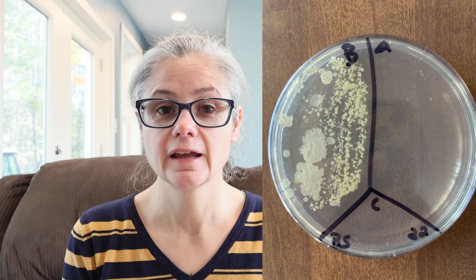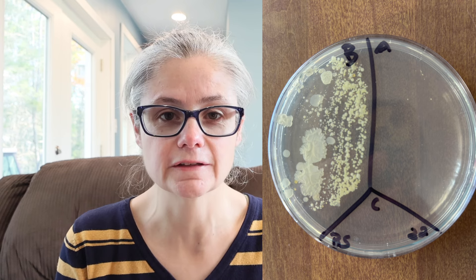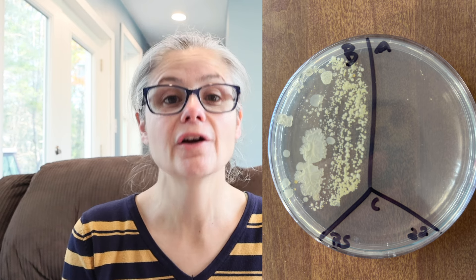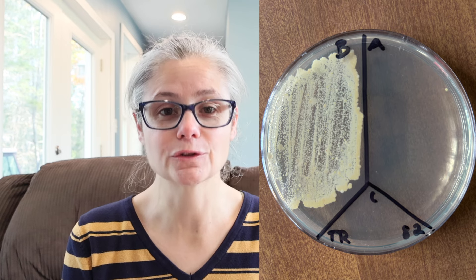The bathroom sink: in the before section we can see a lot of bacteria, and in the after section there are two tiny bacterial colonies. So the Pure Oxy Life 3% pre-diluted hydrogen peroxide did an excellent job removing the bacteria from my bathroom sink. The toilet rim: in the before section we can see a tremendous amount of bacteria, and in the after section there's just one tiny bacterial colony. The Pure Oxy Life 3% pre-diluted did an excellent job removing bacteria from the toilet rim.